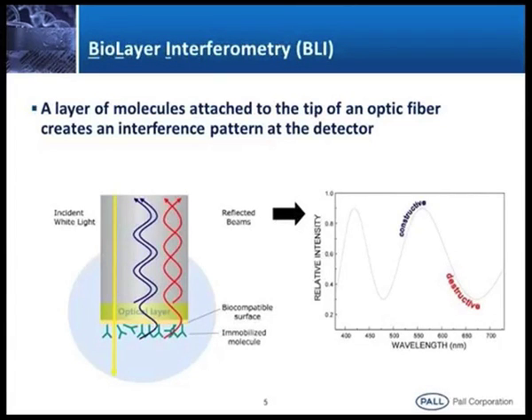When we say there is an interference, suppose I put one stone into water, you see there are waves, right? If I put two stones simultaneously into the water, what happens? Waves will go that side, but on this side they are mixing together. Then we call it an interference.